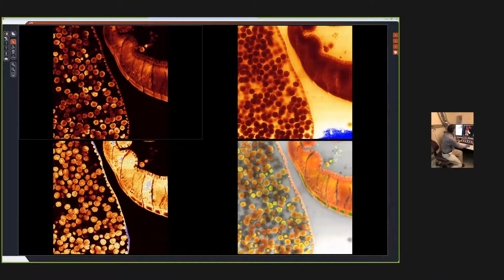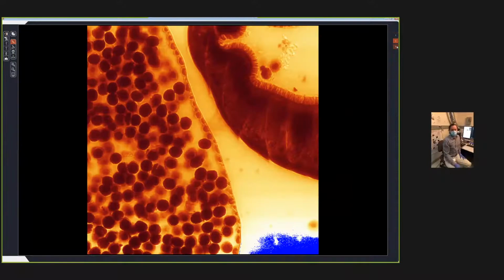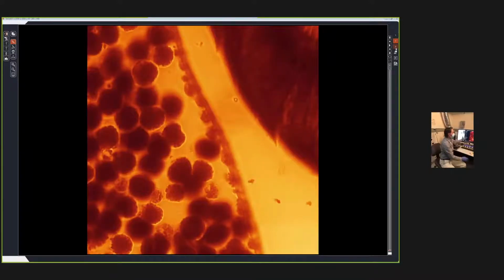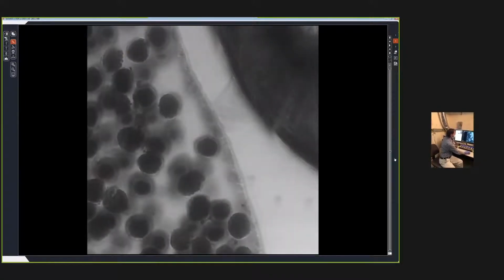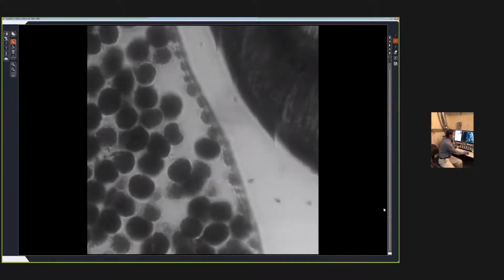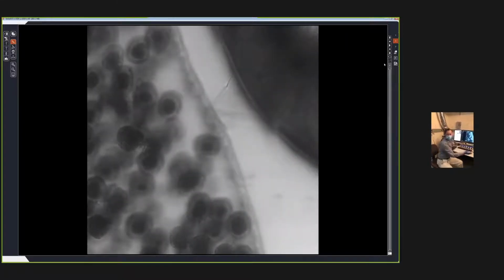Going back to the theme Adam was talking about, looking at what we normally see through a microscope, it's hard to appreciate how revolutionary confocal is. With standard microscopy, you're only able to see one field of view. This is transmission mode, and normally it would be black and white. When you scan up and down through the object, you can look at all stages, but you have a blurry version of the image.